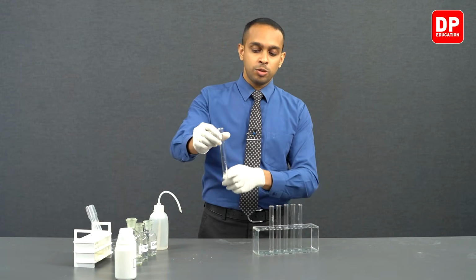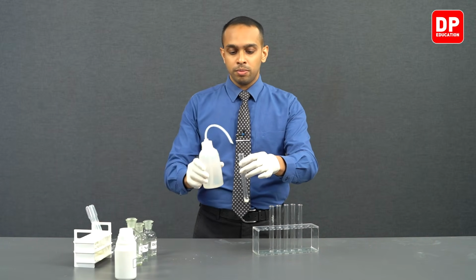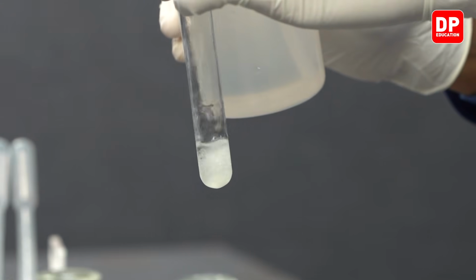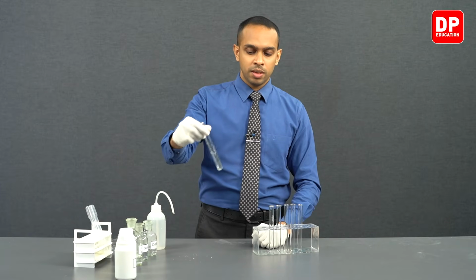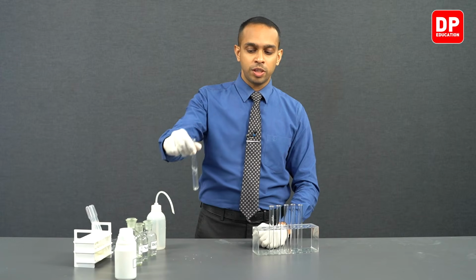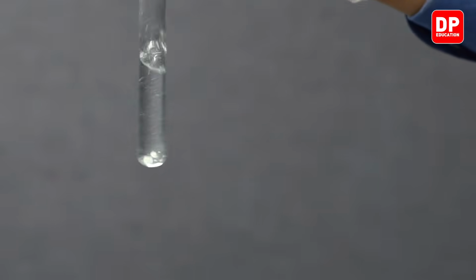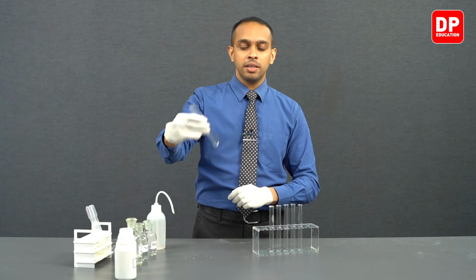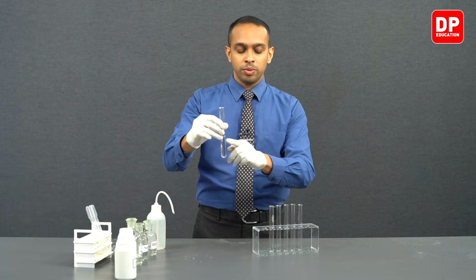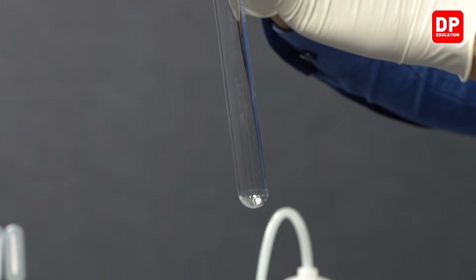And after taking a small solid sample of aluminium chloride, we can dissolve it by adding a little bit of distilled water. As you can see, when it dissolves, it forms a clear solution. And now students, we are going to take a small volume from this original stock sample into a separate test tube.